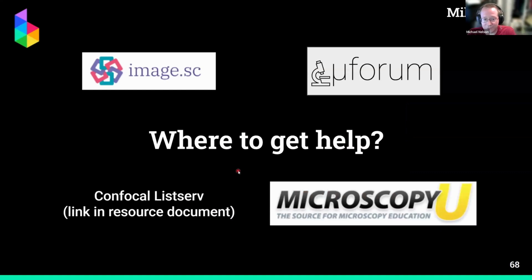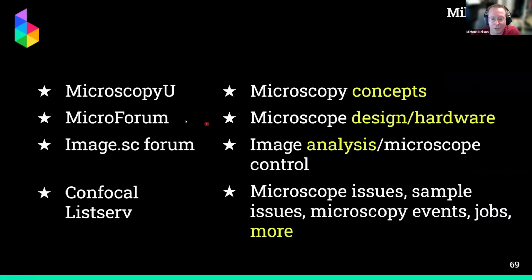All right, so this is a where to go to get help. It's not actually necessarily about help, because the first thing I'm going to discuss is Microscopy U. But basically, there's 4 or 5 things here, and I just want to go over them.